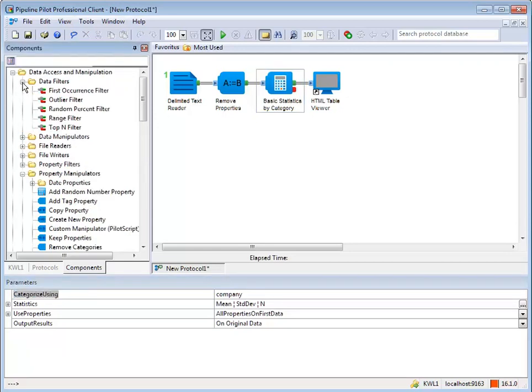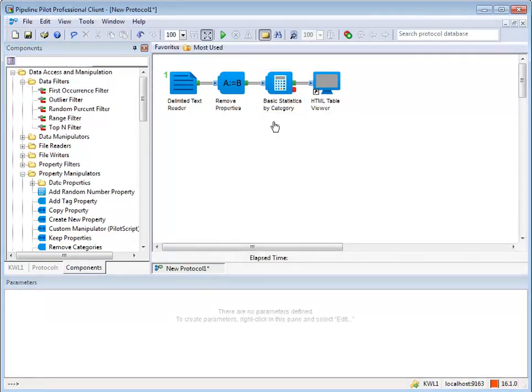If the component is being inserted between two components, the cursor changes to a parallel icon and the pipe is highlighted.